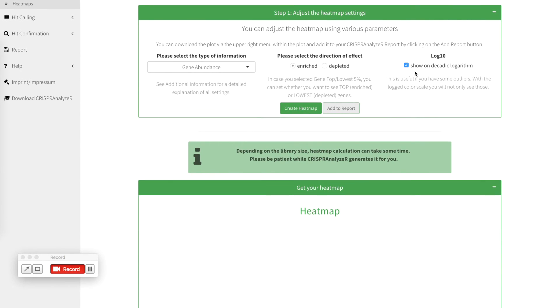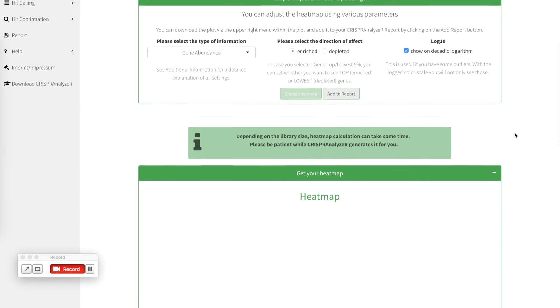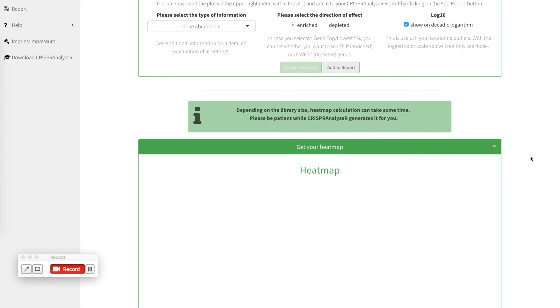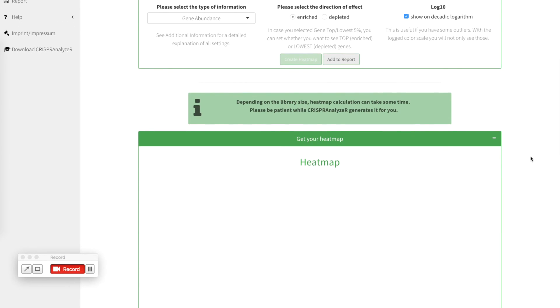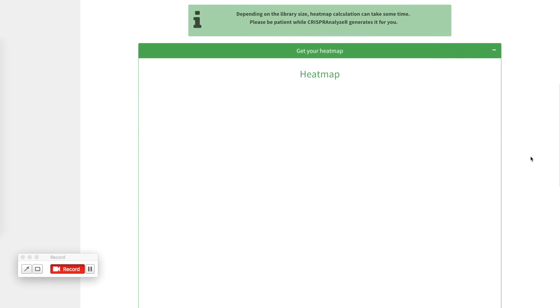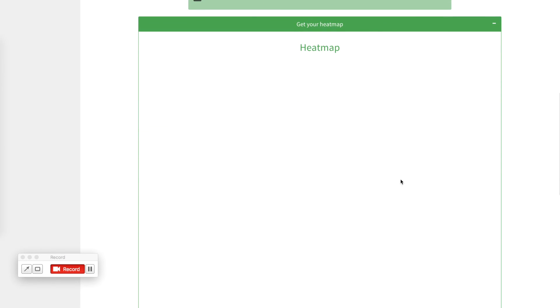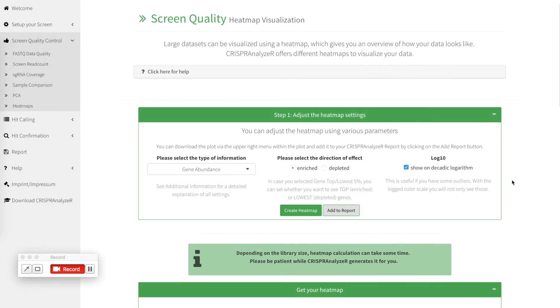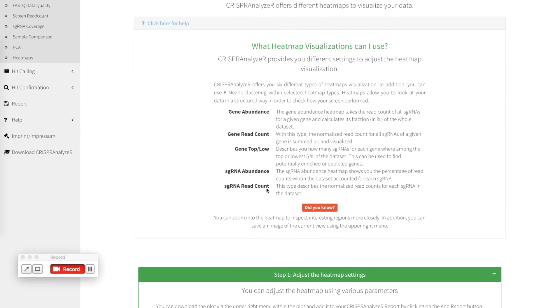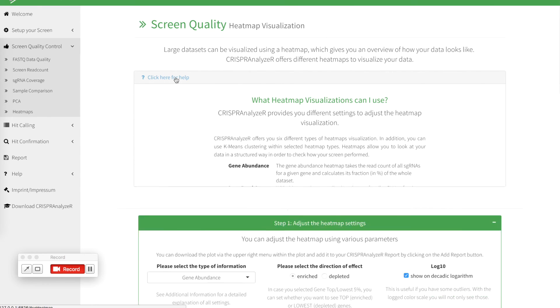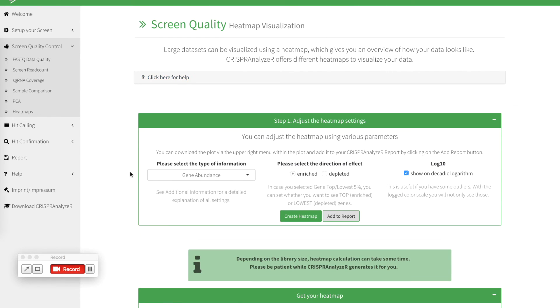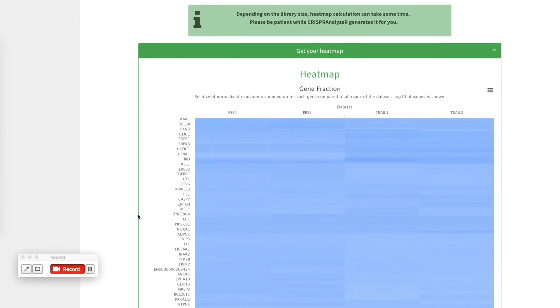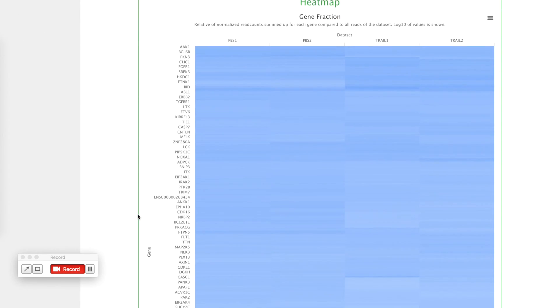I would like to have it on a log10 scale. So I just click create heatmap and CRISPR analyzer is calculating the heatmap for me. Please be patient as depending on the library size, this can take some time. And once the heatmap is finished, it will show up in this box. While we are waiting, you could click here for help to see more information what each of the types of data you can select will be.